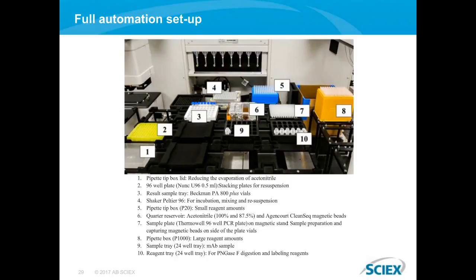The single-use magnetic manifold provided with the kit can be used for a couple of samples, but it's not very convenient if you have dozens of samples. In that case, it's better to use a liquid handling robot, and we at SCIEX have tried and evaluated the Biomek robot, and it works just beautifully.